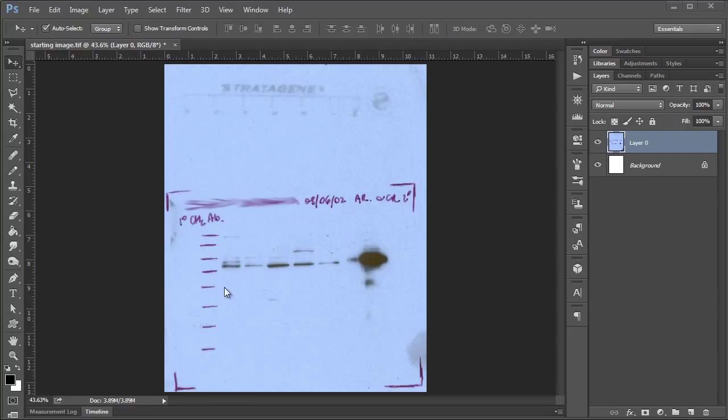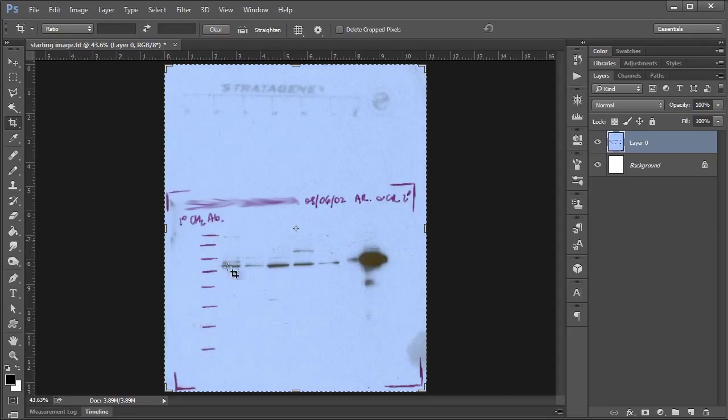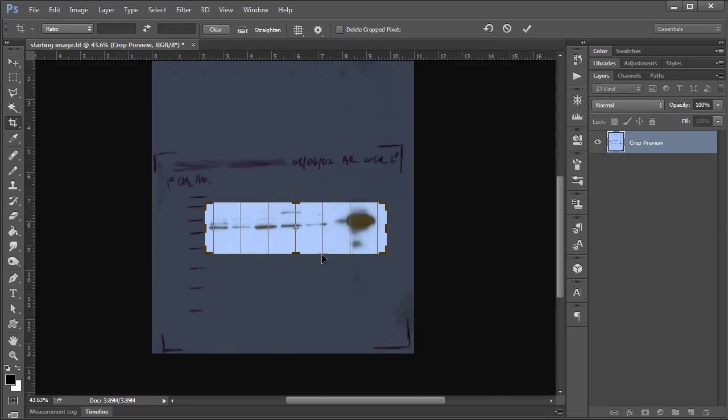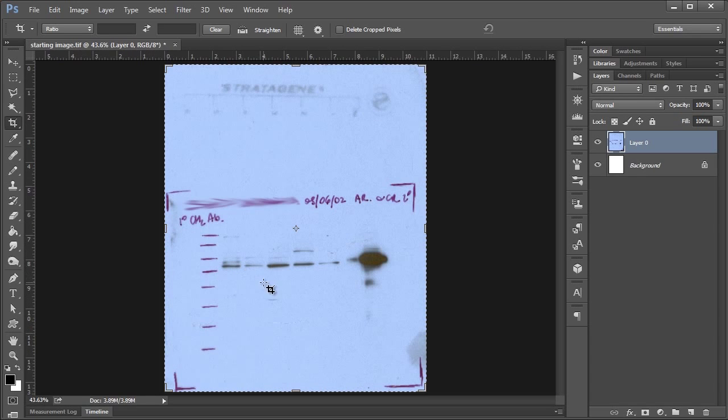To show you what I mean, if you're like me, or at least the same way that I was when I started using Photoshop, if I had an image, in this case just a scan of a Western blot here, and I wanted to get rid of all this extra junk and just wanted to keep my bands, what you may be tempted to do is use the crop tool to crop out the area that you're interested in, which I'm just going to exit out of that because I don't want to do that.